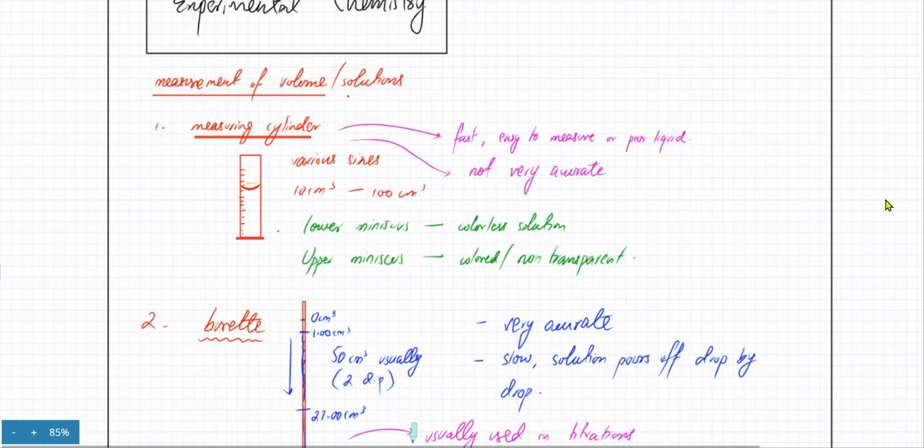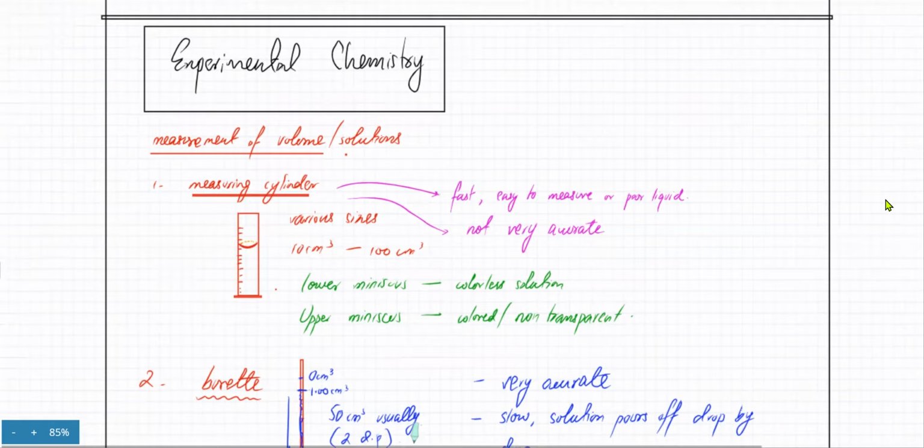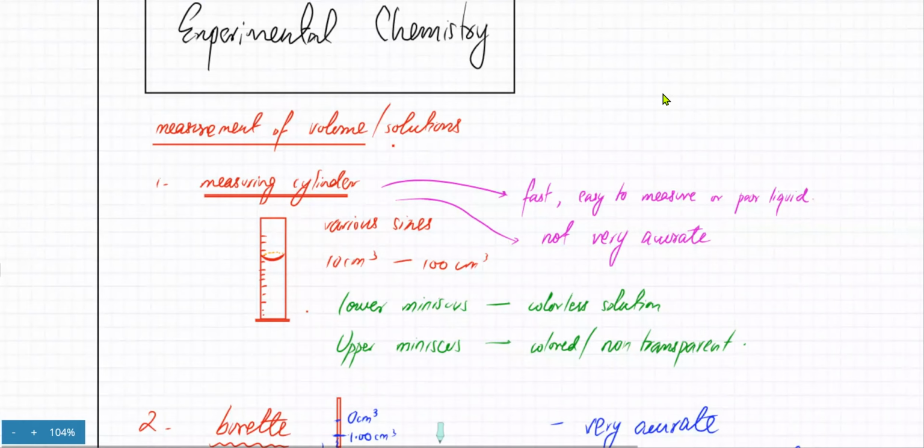Last time what we discussed, let me give a quick recap. We had started experimental chemistry, and this is very useful when it comes to ATPs specifically. And in between, everywhere somewhere this has some work in the other papers too, ठीक है। So, but in ATPs, it's very important, and you need to understand the tiny bits of information that's associated with each of the apparatuses in the lab and how you're going to use them.